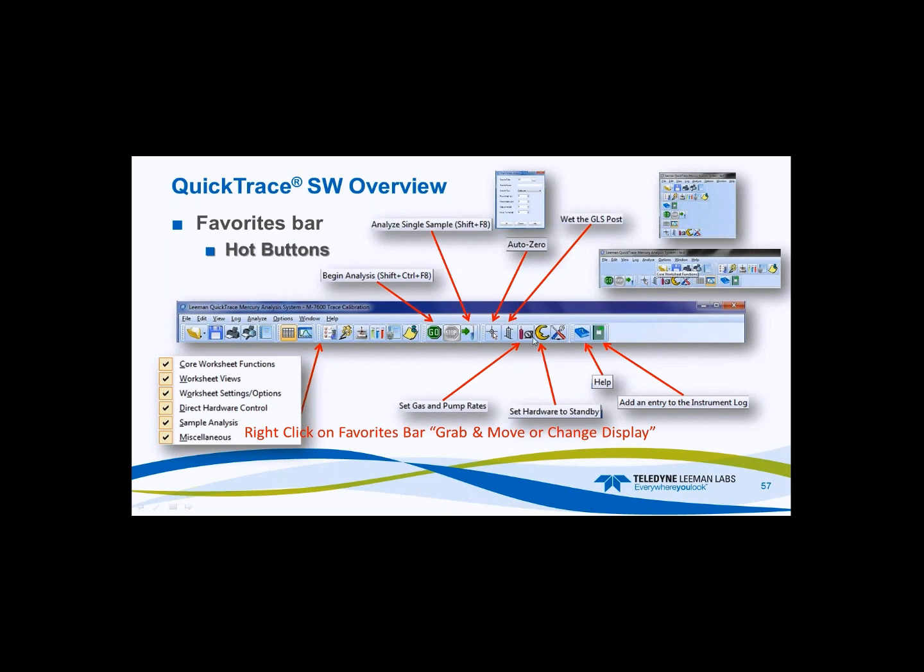You can automatically have it go into standby, click to move, and it takes those features from standby and implements them. You can go directly to the help, and you can add an entry to the log right here.